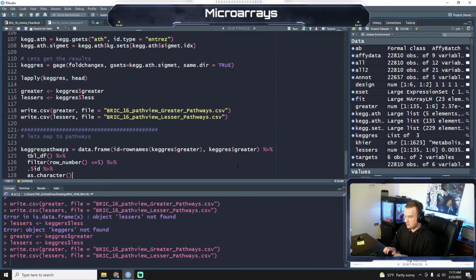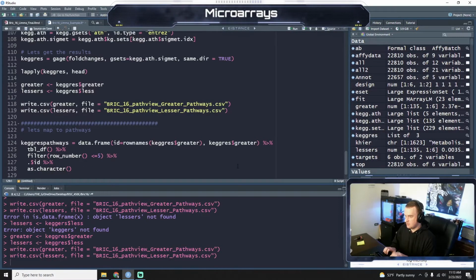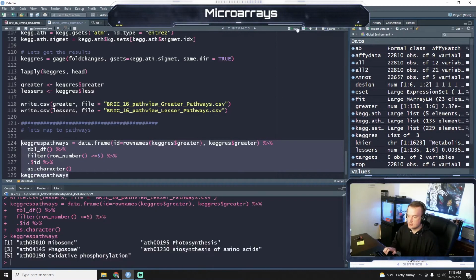Character. Okay, let's run this real quick.